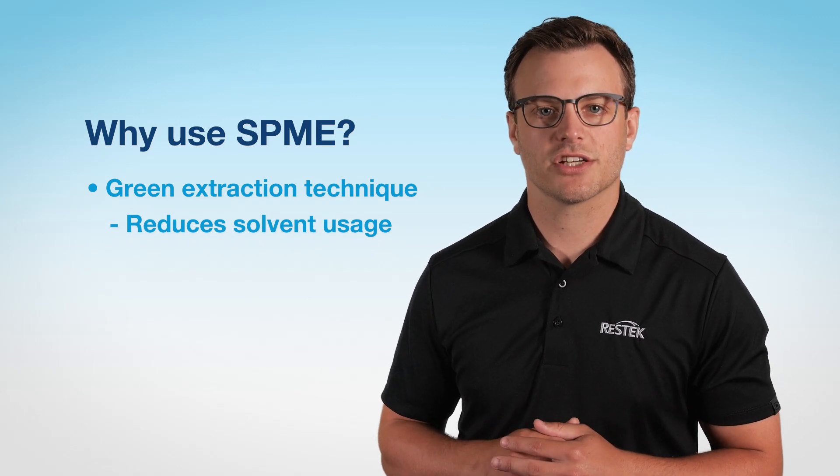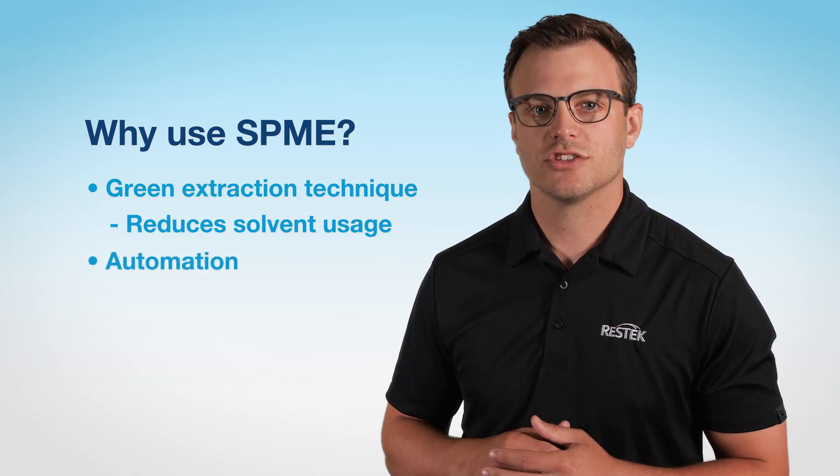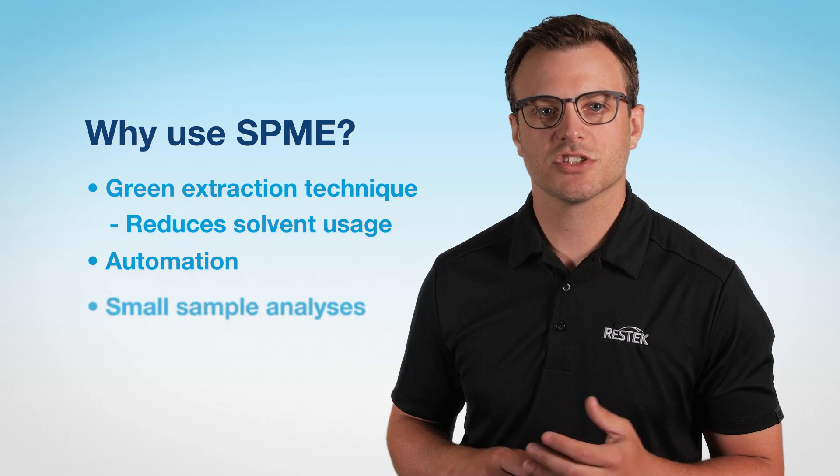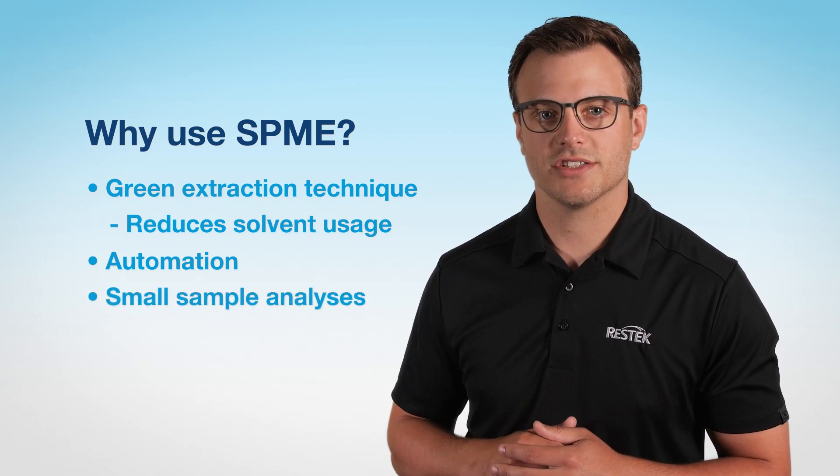SPME extractions and desorptions can be fully automated with a variety of auto-samplers. It's also effective for analyses with small sample amounts, opening it up to a wider range of applications.